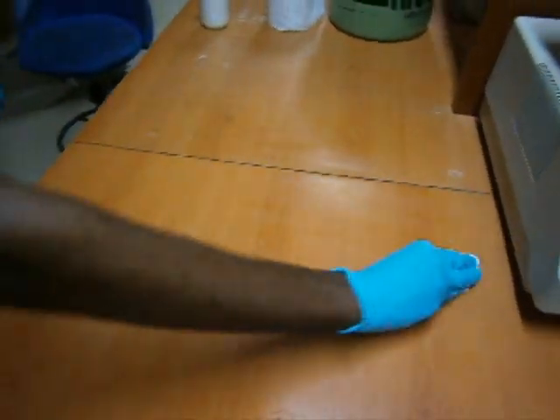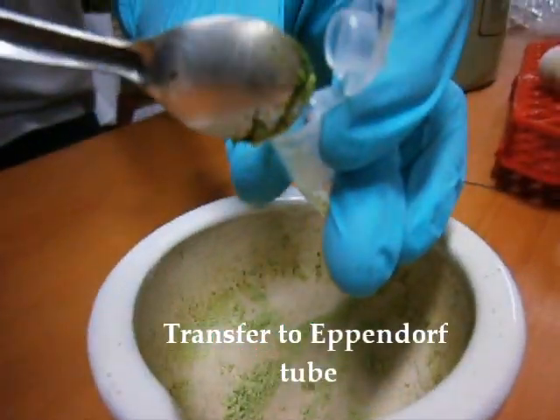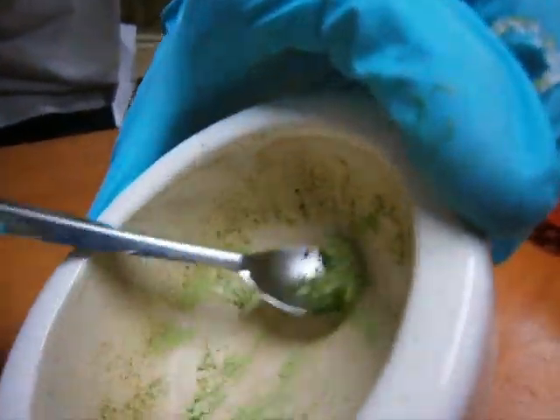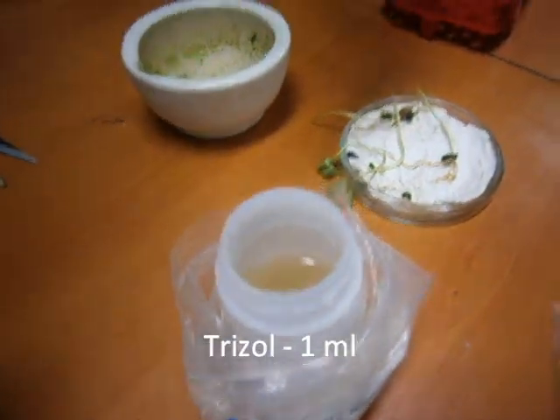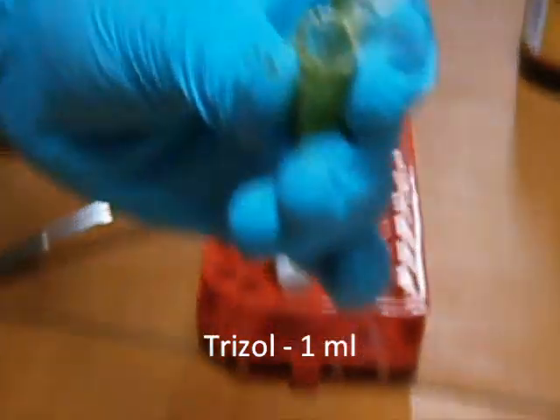Wipe the table with 70% ethanol. The sample was ground using liquid nitrogen. The ground sample was transferred into Eppendorf tubes for proceeding further. One ml of triazole solution was added to the ground sample.